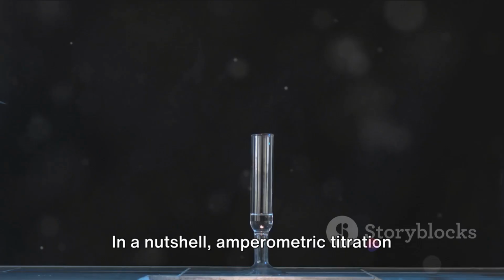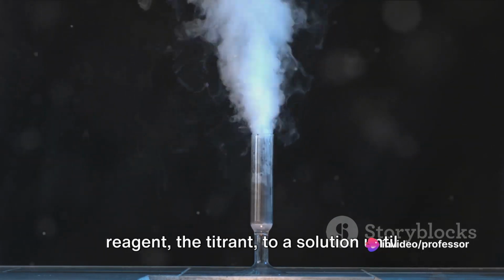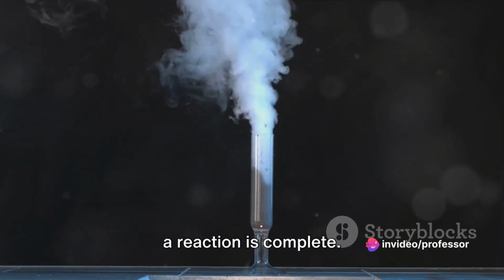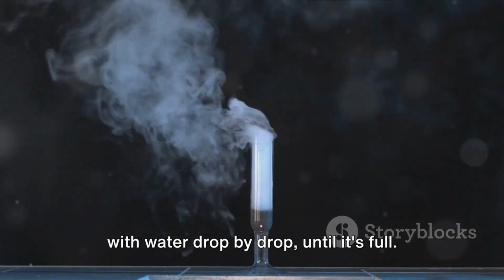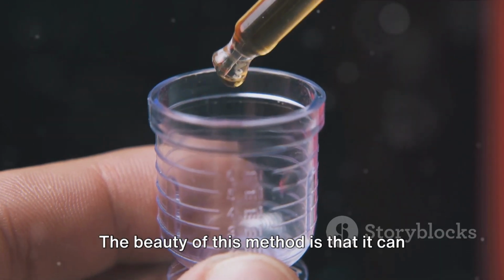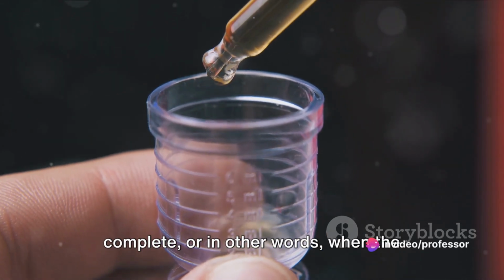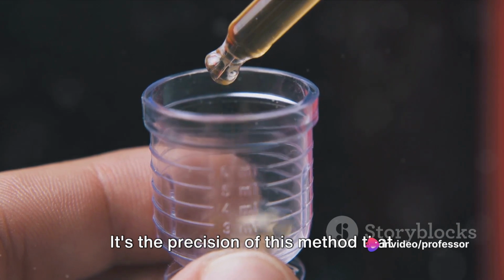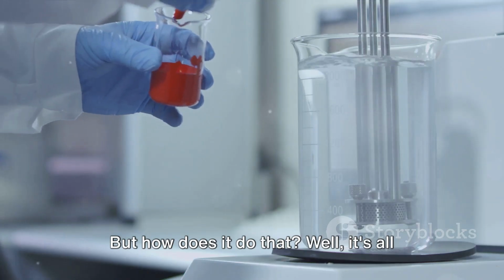In a nutshell, amperometric titration involves the gradual addition of a reagent, the titrant, to a solution until a reaction is complete. This process is akin to filling a glass with water drop by drop until it's full. The beauty of this method is that it can tell us precisely when the reaction is complete, or in other words, when the glass is full. It's the precision of this method that makes it truly fascinating. But how does it do that?